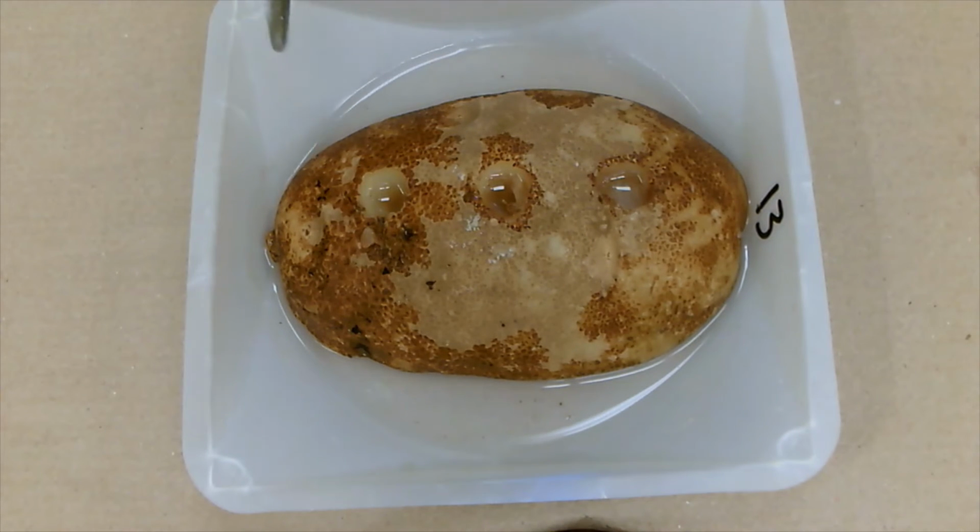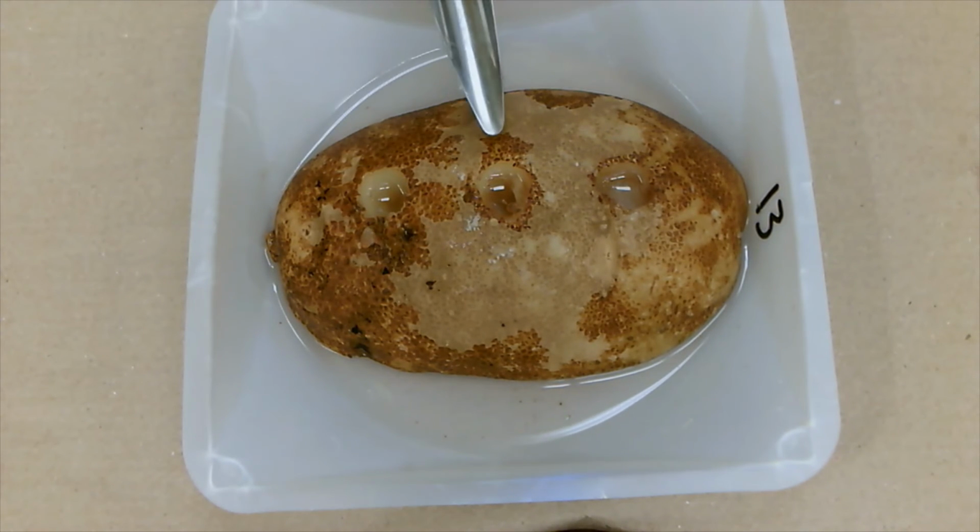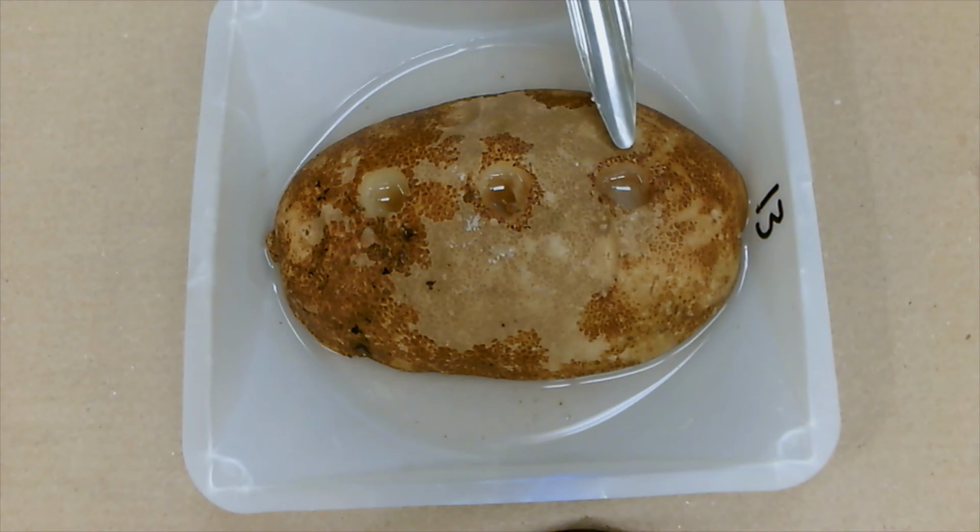All right, so we have here our three holes after about half an hour. This one that had distilled water, the water level hasn't really changed that much. This one that had salt water, it's actually almost overflowing, so the water did rise. And this one right here that had salt in it before, you can actually hardly see the salt, and you can see that there's a lot of water that has accumulated here.